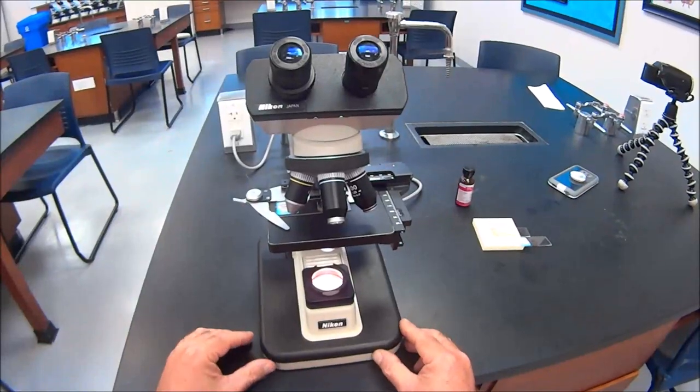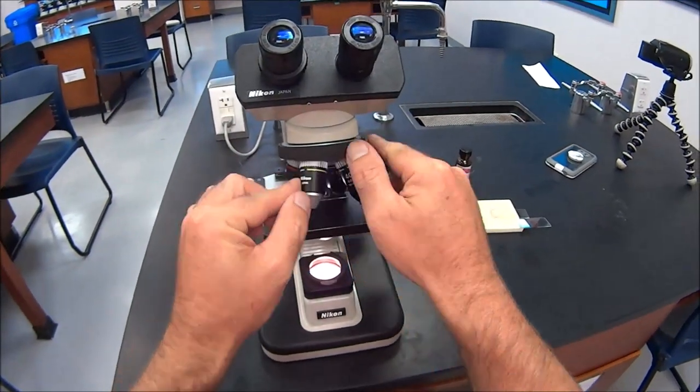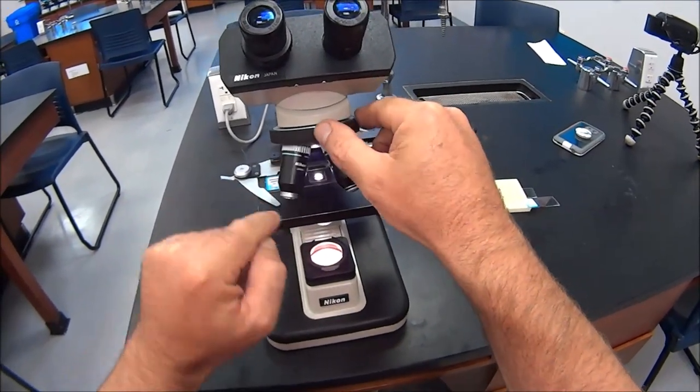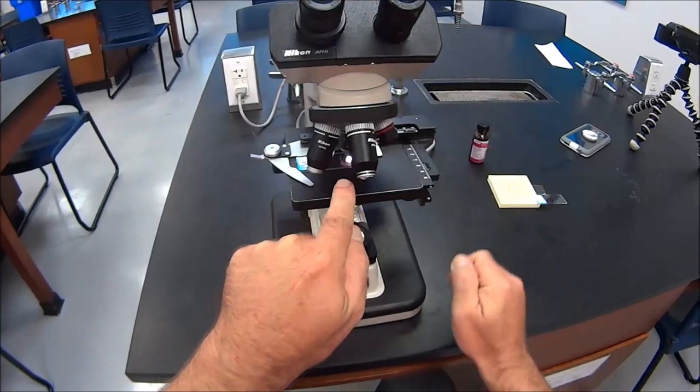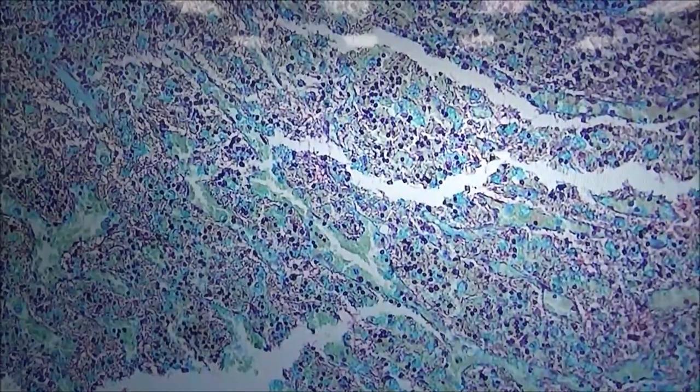We're not able to see much detail yet, so let's go to the next magnification, the 10x objective lens. Now that we got it in focus at low power, we then go to the next lens, which is this yellow striped lens. That's 10 times the magnification of the naked eye. Here we are at the 10x objective lens magnification. We're starting to see some cells, but those are not bacteria. Those are lung cells.